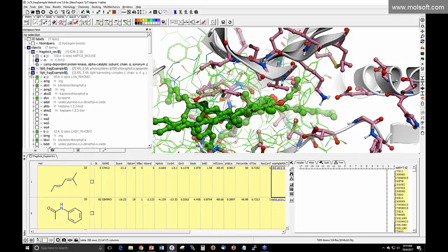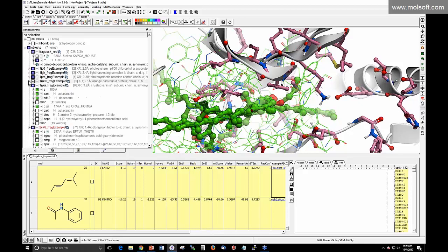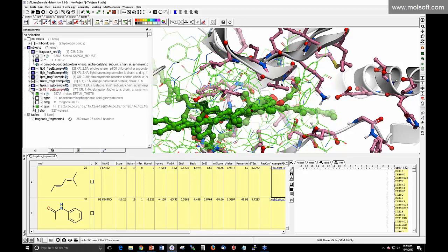It's loaded 1JB0, 1LGH, 1PRC, and other PDBs which contain this fragment. You can then compare them individually and check whether your pose makes sense in terms of the p-value and also the score, and also compared with the PDB.